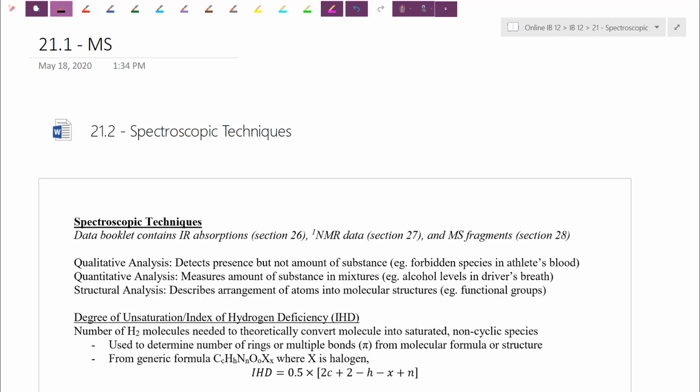Morning, everyone. So today we're going to start into a new section here. It's actually a very tiny section. Now that we've introduced a lot of the organic families and different functional groups here, we're going to see some experimental techniques and some instruments we can actually use.